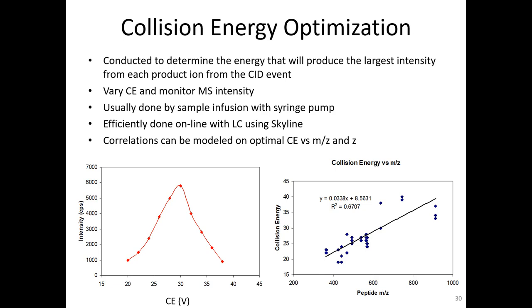This works very well, and it has the potential to plot each peptide based on its charge state, not just mass to charge. So your +2s will have one regression, your +3s will have another. If you have +4s, there could be another.